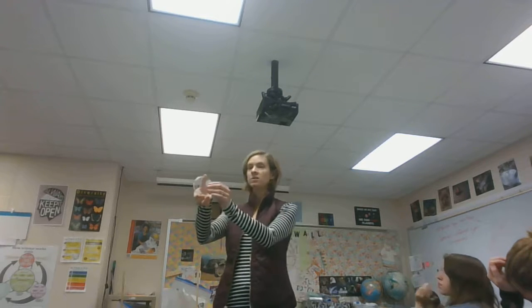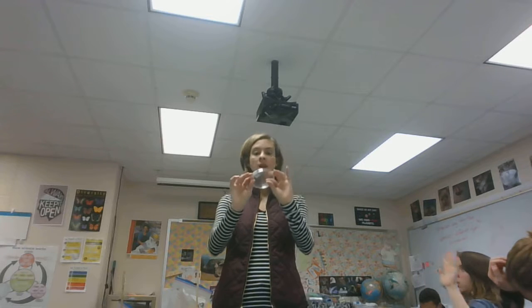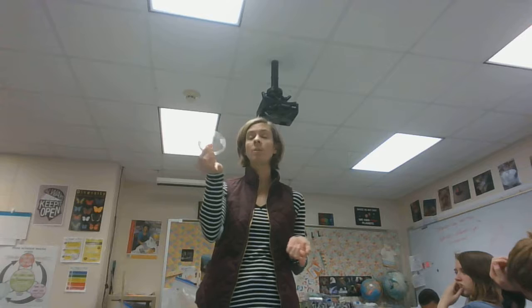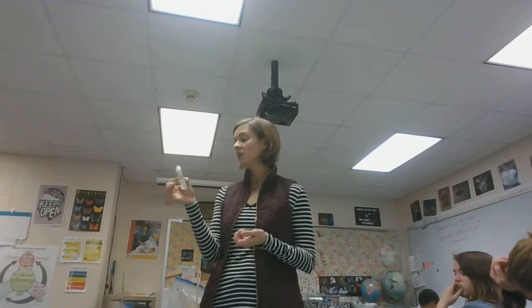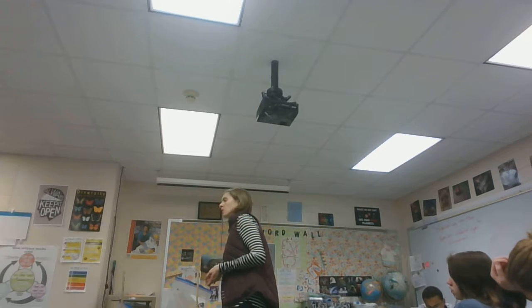Yeah, you flip them upside down. They stick. Check it out. Right? Oh, they're really small. Yeah. So he's not going anywhere, so don't worry about it. I do ask that you don't tap them or drop them on the floor. We do need to take care of our organisms. It is our goal to create a population of these, so they need to survive. No. Treat them with respect.